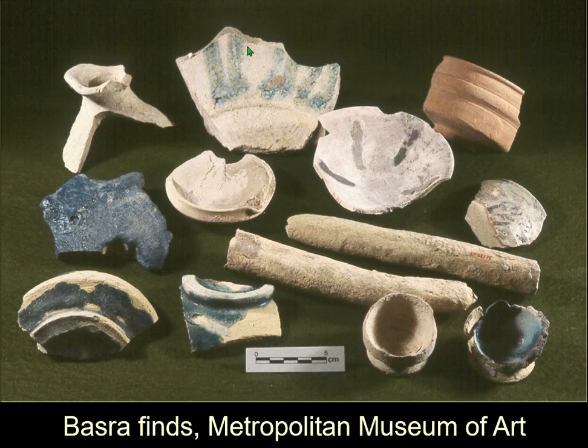And so it would all fuse together, which is a really bad thing. And so you just want to have it sitting lightly on something which you can remove. This here, see this scar and the glaze here, would be from resting on one of these. And so you can see this has been removed from resting on some of these rod-shaped kiln furniture things.